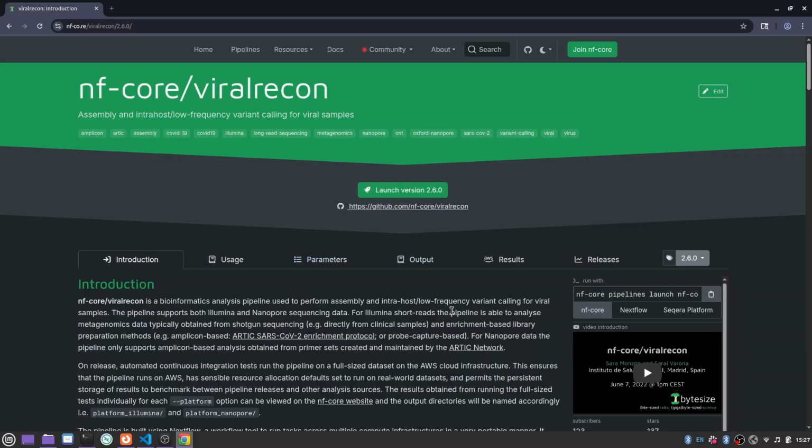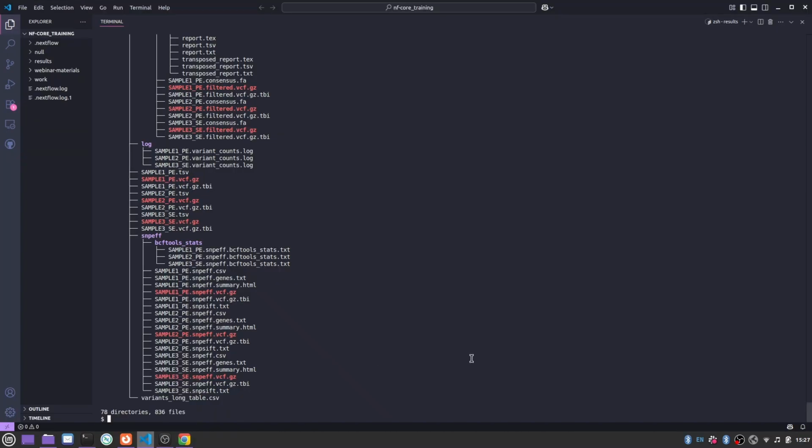That is the end of this episode. To go back to some key points, let me go back to my terminal here. Ready-to-use nf-core pipelines can be found on nf-core's website or by using the nf-core tools pipelines command with the list option. After you've downloaded an nf-core pipeline using nextflow pull, you can test it using nextflow run with the test profile. And a profile is a configuration file that contains settings that tell Nextflow how you want to run the pipeline.